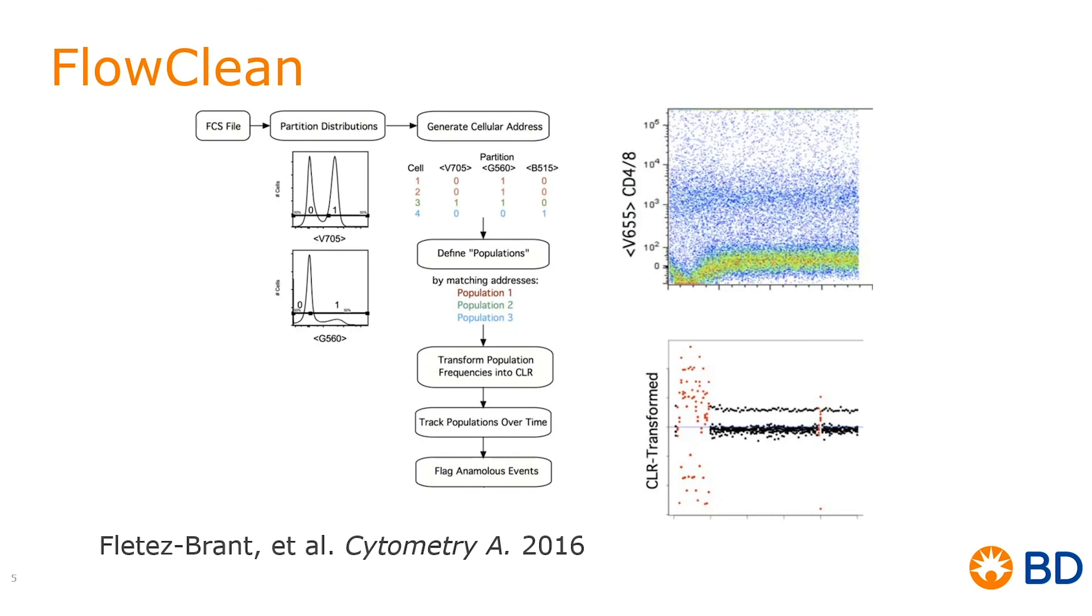Next is our plugin, FlowClean. FlowClean was previously published in 2016, and what it does, it will take your FCS file. It will then partition each of the parameters into two segments based on the medians.